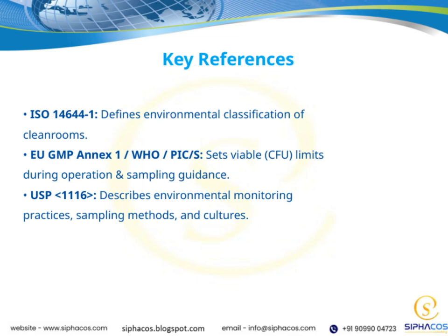Finally, USP 1116 offers detailed practices for environmental monitoring, including sampling methods and culture techniques. This ensures we have reliable, consistent ways to detect and quantify microbial presence. Altogether, these references form a comprehensive framework that supports safe and compliant cleanroom operations, tying back to our overall goal of maintaining product integrity and patient safety.